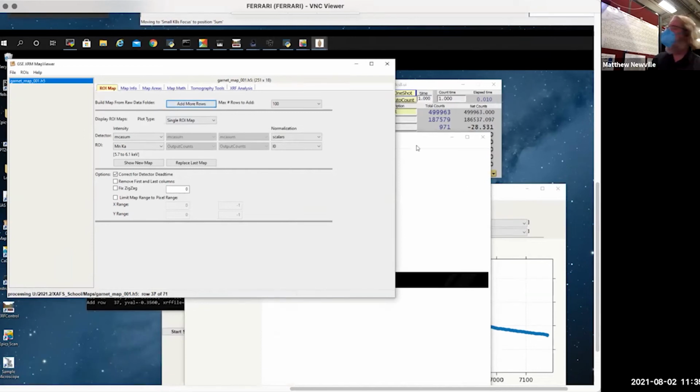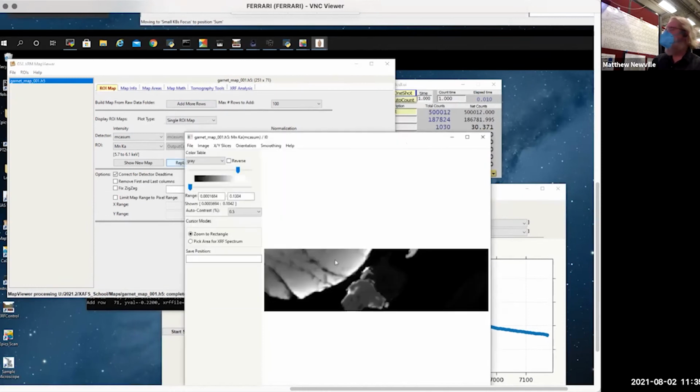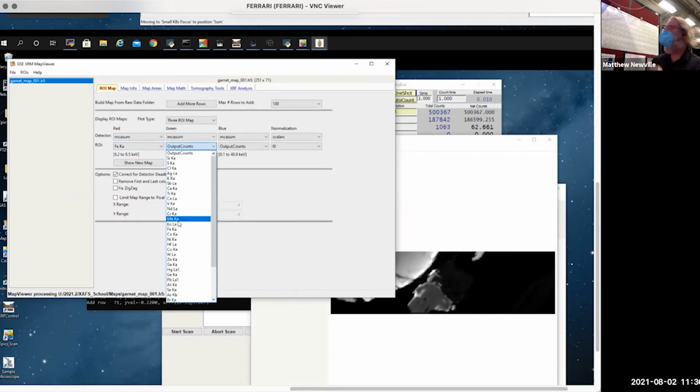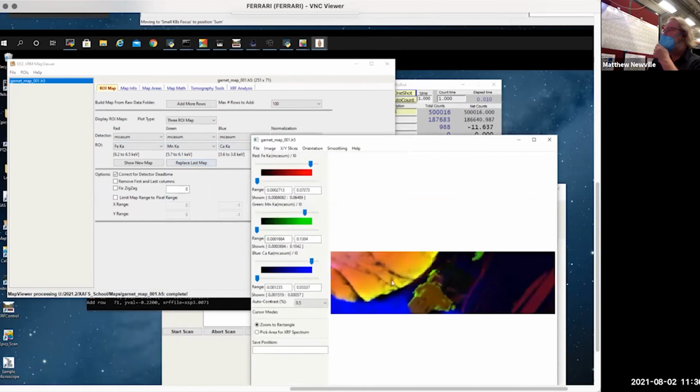This program both shows the data, but also helps build the data from the raw data that's collected. So with that, like I said, that's now our map. That's for manganese. And if we look at, well, we also collected iron, but not so well. So I'll make a three-color map where we put, say, iron in red, because iron should always be in red, and manganese in green, because manganese is photosynthesis, so you can remember that, and maybe calcium, which is pretty big in this. And there, now we have a map that has iron that we see, and manganese, as well as calcium.